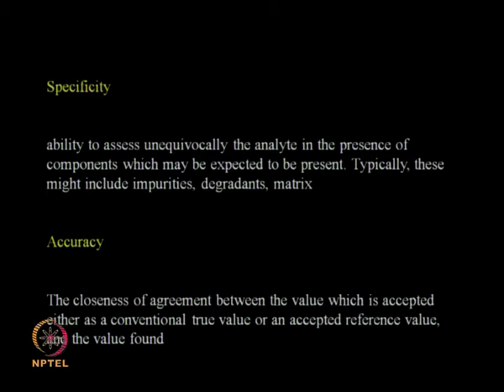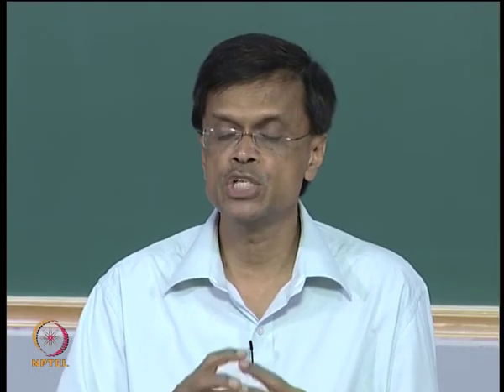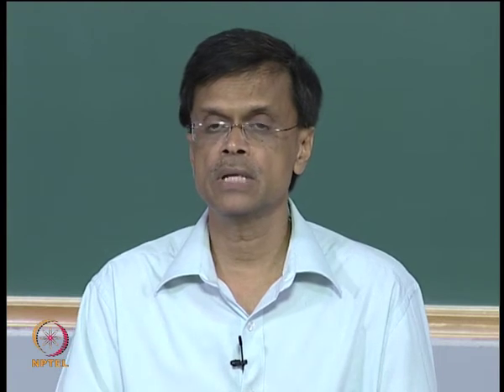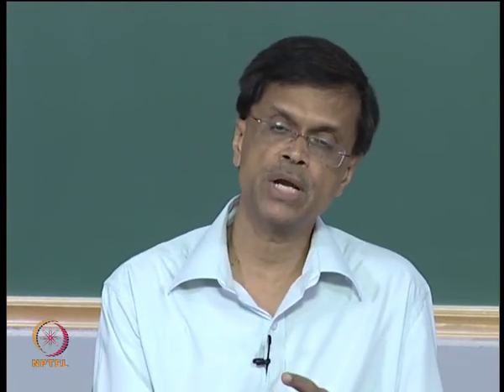Specificity is the ability to assess without any doubt the analyte in the presence of components which may be expected to be present. That means you may have many components in your mixture, but without any doubt the instrument should be able to detect your component of interest. The mixture may contain impurities, degradants, matrices and so on. You may have many components, but the analytical technique which you are developing should clearly show the component which you are trying to identify.